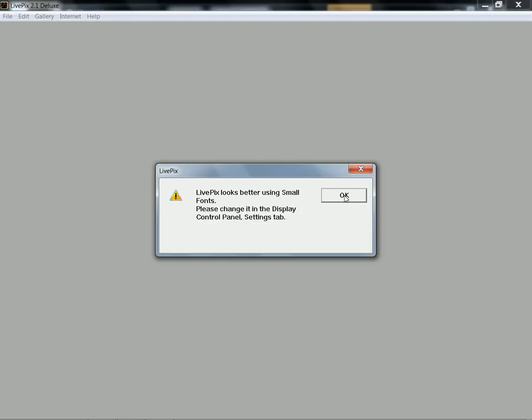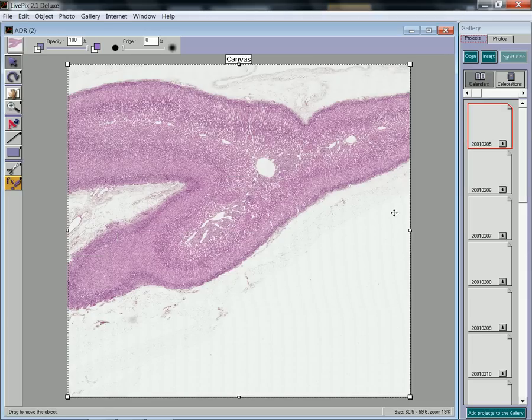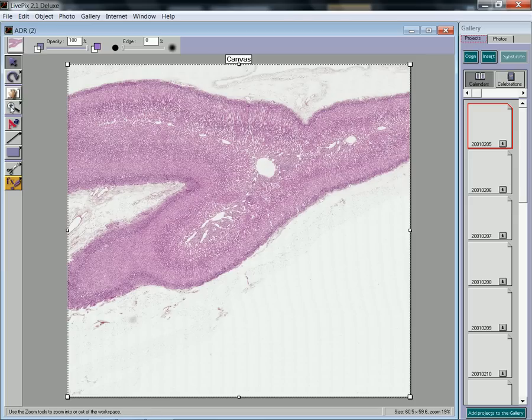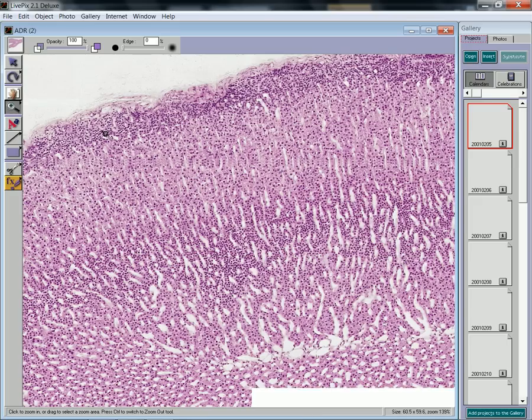I can now click on the adrenal, for example, and get the same microscopic image.